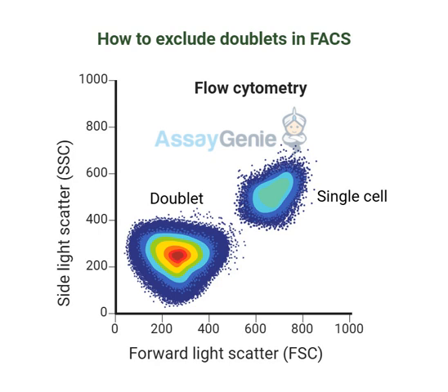Even something as seemingly small as doublets can really impact the results, so getting it right is crucial. You know, listening to all of this, I'm realizing that this is way more than just a technical detail. It's about making sure the data scientists get is reliable so they can draw the right conclusions. But why does all of this matter in the grand scheme of things? What's the real-world impact of getting this right? We'll explore that and more in part 2.